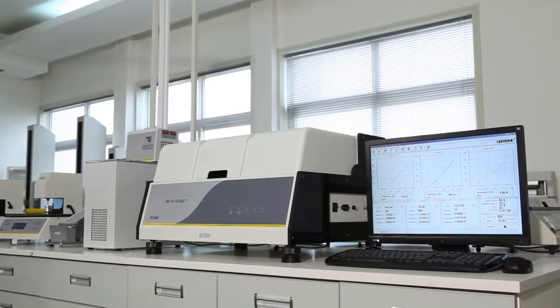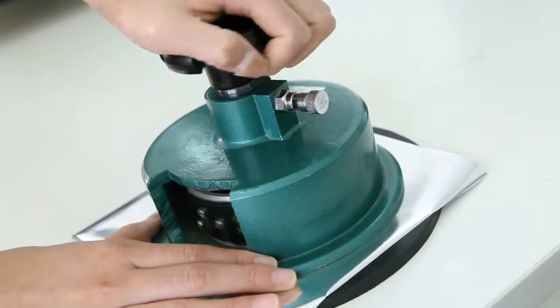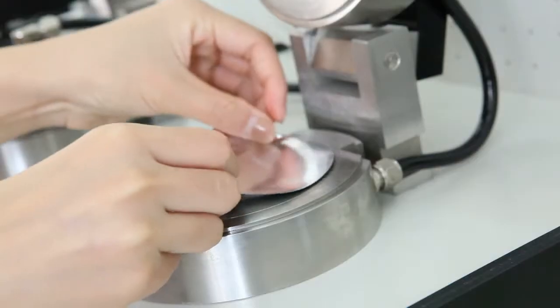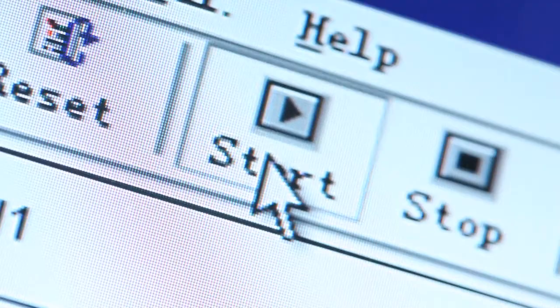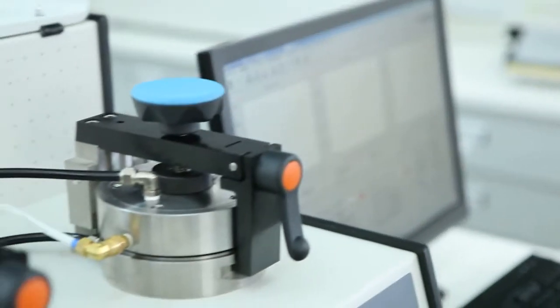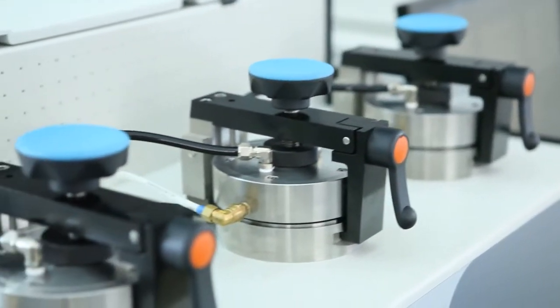Operating the instrument is simple and convenient. Users only need to place the prepared specimen into the test chamber, complete the parameter setting and click on Test. The VACV2 will then accomplish the test automatically.